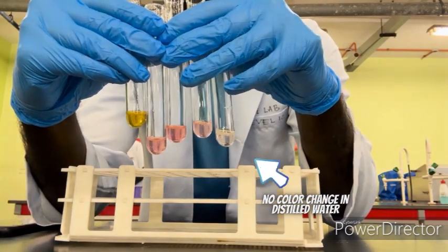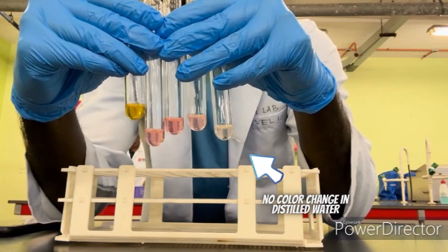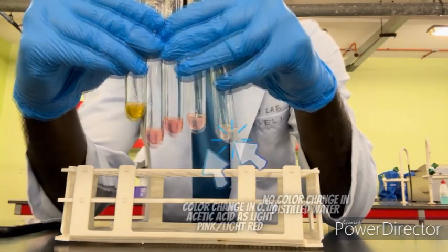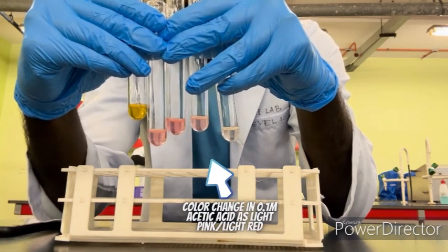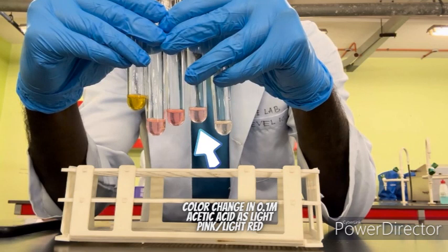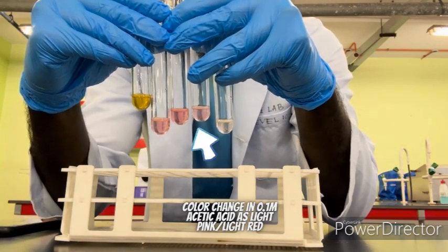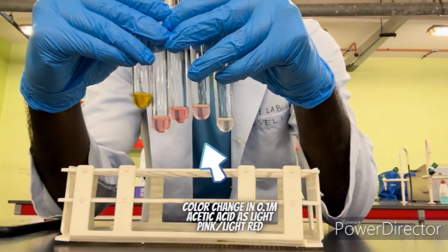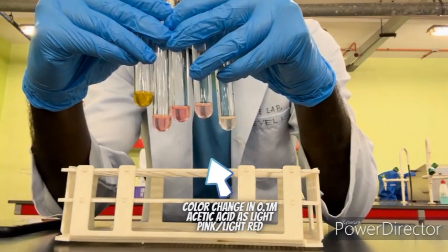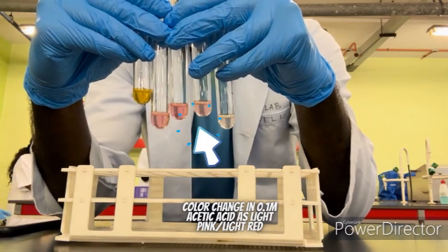Okay, so the first one will be distilled water. So we can see here there's no change in color. So this one is considered as neutral, and the second one is 0.1m acetic acid. So you can see here there is a light red or light pink. You can see there is a change of color once we added the onion peel extraction solution. So this one is considered as an acid.